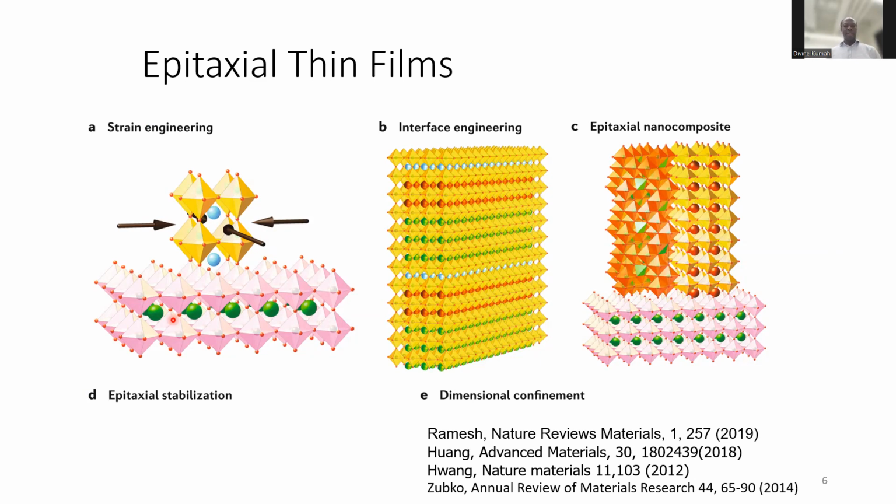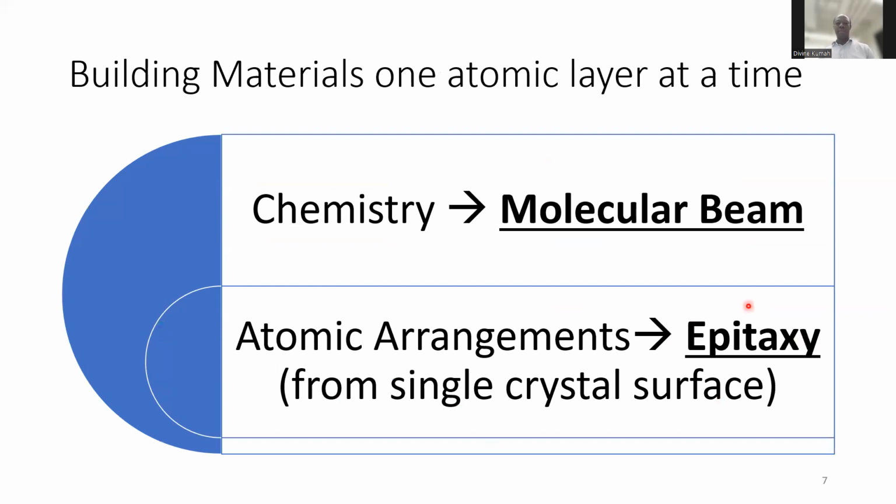The other thing we can do with epitaxy is also change the crystal orientation or the crystal structure. So in most materials, if you were to grow them out of solution or just try to make a big ball crystal, there is some equilibrium crystal structure that the atoms would like to form themselves in. But if we have a surface and we deposit that material on top, because of this process of epitaxy, where the atoms you're putting on top want to mimic the arrangement of the surface, you can also use this as a way to control the crystal structure and the crystal orientation of the film you are growing. So that is going to be referred to as epitaxy.